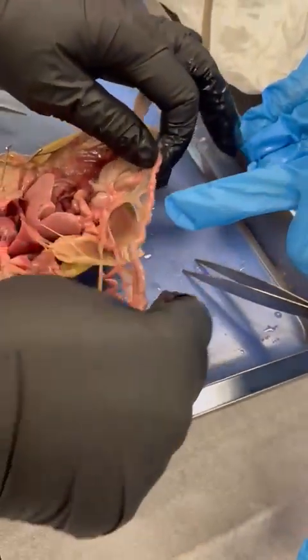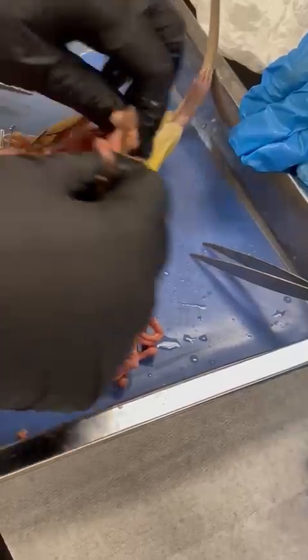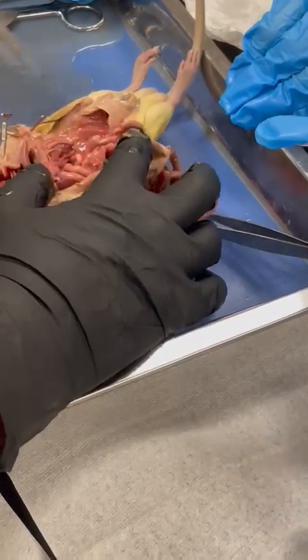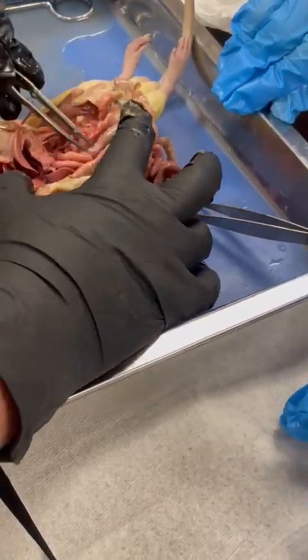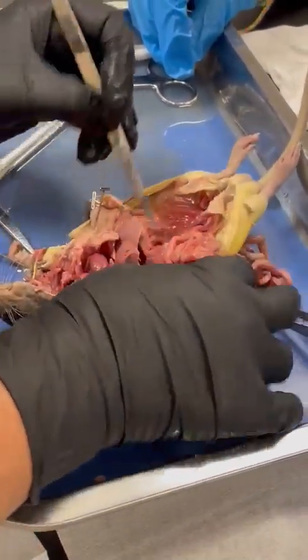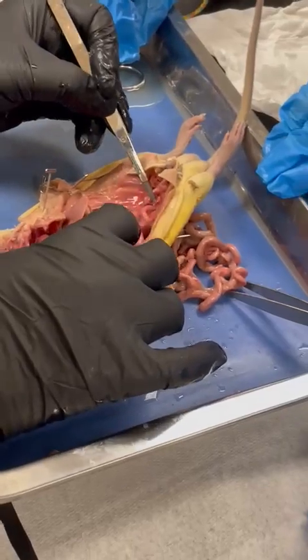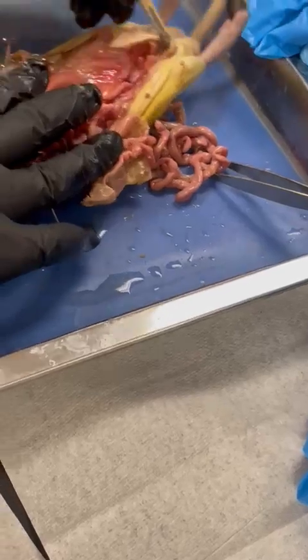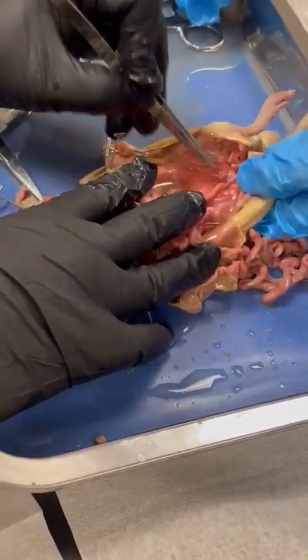This is the mesentery too. Yes, all of this is mesentery. So it goes into the ascending colon, transverse colon, descending colon. And that is the cecum, the first part of the large intestine. And all this is small intestine. It goes into the rectum.